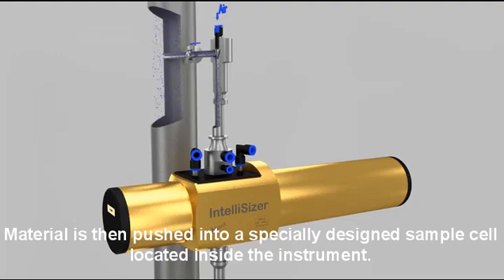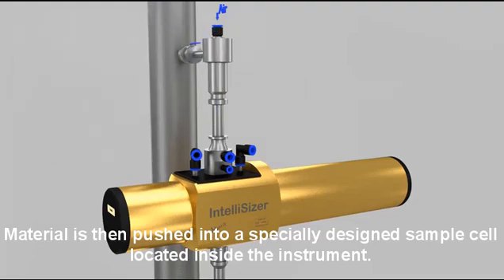Material is then pushed into a specially designed sample cell, located inside the instrument.